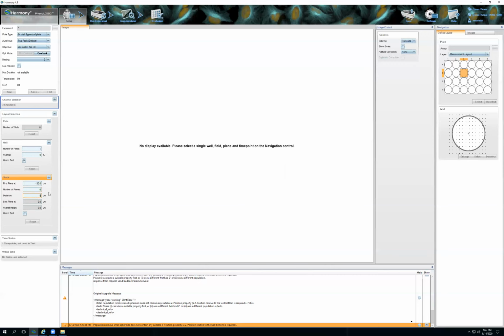So I am going to start 130 microns below my center height. I'm going to do 56 planes. We'll try that at 5 microns. So this basically, you can look on the right over here, it goes from negative 130 microns, 5 microns, up to 140 microns. So I'm basically saying that my spheroid, I think, is generally less than 270 microns total.